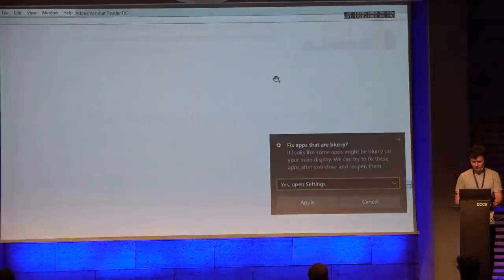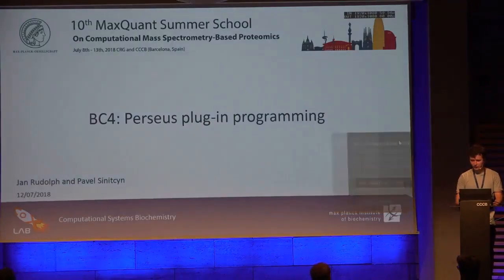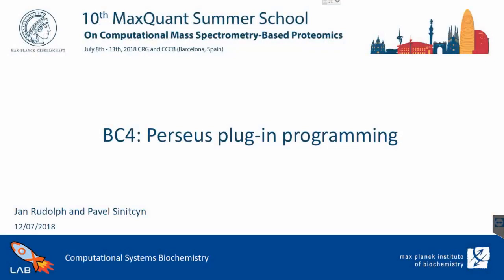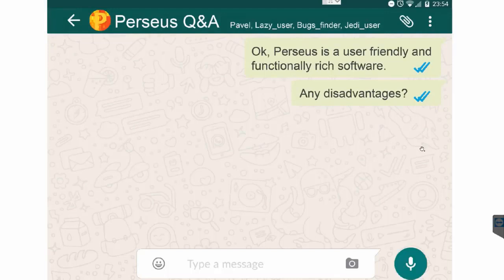We had a few lectures already about Perseus, and a few practicals. Basically, what I actually wish to ask you: Perseus is really cool software. It's user-friendly, plug and play. Are there any disadvantages?